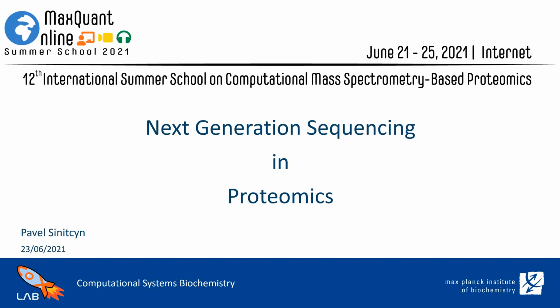Of course, this presentation is going to stand a bit as an outlier from most of the presentations, but I think it's very important to highlight how you can use a very huge and quickly growing topic like next generation sequencing, which now can even, in a routine way, sequence single cells for transcriptomics and other omics. So how can we use this information in proteomics? It is actually to improve proteomics results, or to find something else, or to answer some new biological questions.